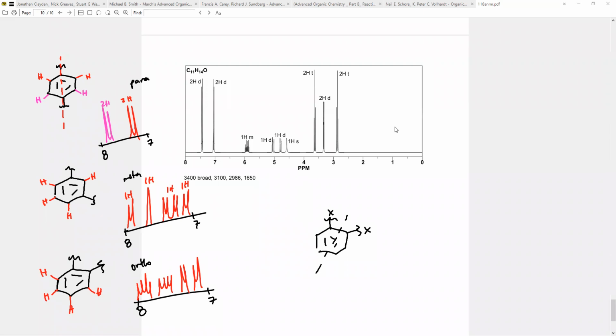Oh, you know what? I have ChemDraw. What am I doing? Just use ChemDraw and see what ChemDraw says. It's a learning experience for both of us, for me and you guys. Okay, so it turns out ChemDraw kind of says it's the same. It is going to be kind of like a doublet. It just looks kind of ugly.